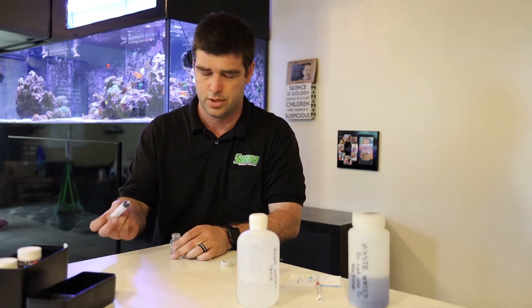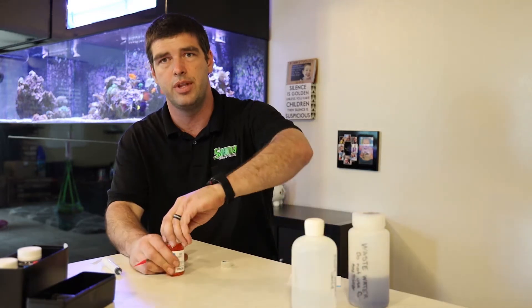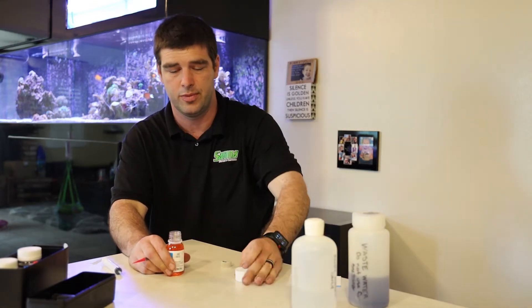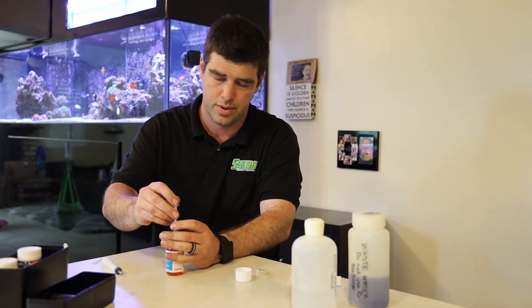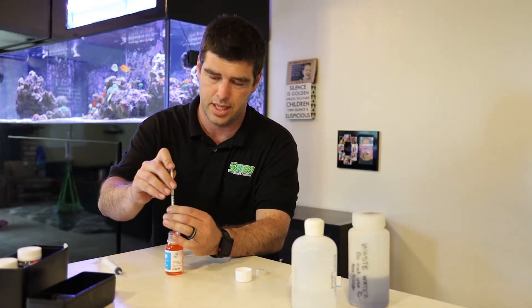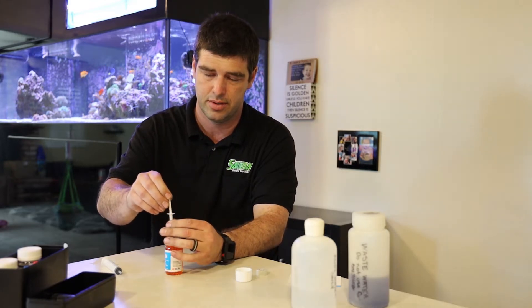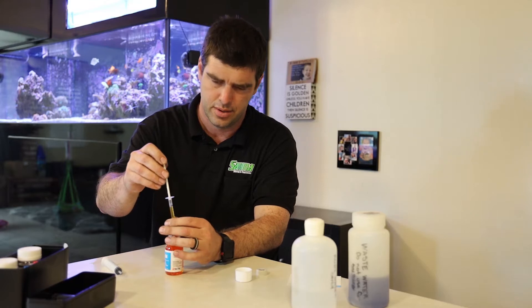Squeeze it in. This is definitely one of the easier tests. Going to get one mil of fluid — kind of did that a little too fast. One mil.